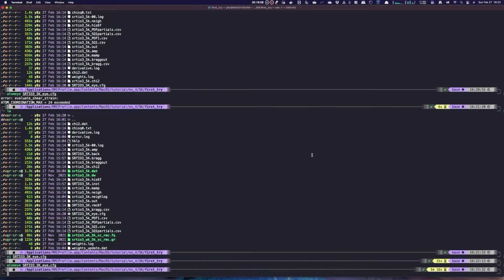And the very next thing and the last thing we want to do is a little bit more useful analysis.